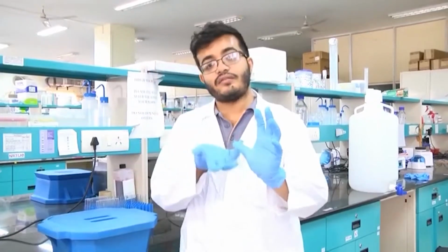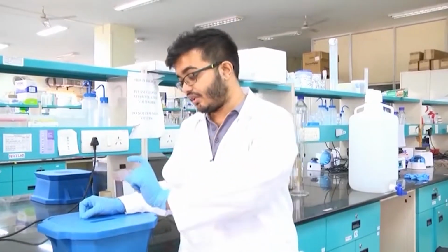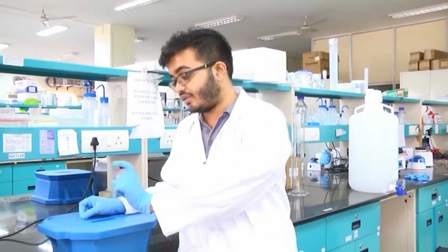Because of this heat shock, the cell wall of the bacteria cracks open. There are slight fissures and cracks, and the DNA that is coated on the surface of the bacteria gets internalized. Immediately after the heat shock, we put them in ice again. We put the vial containing the DNA and bacterial cells, the competent cells, in ice.